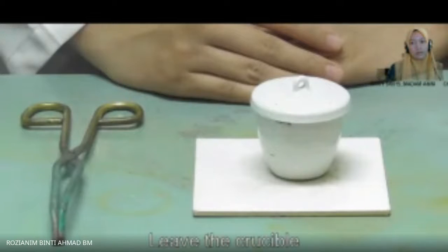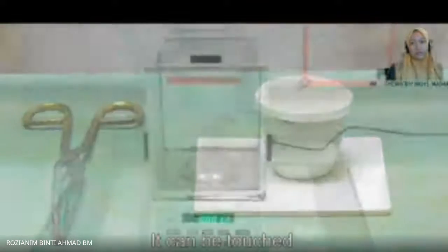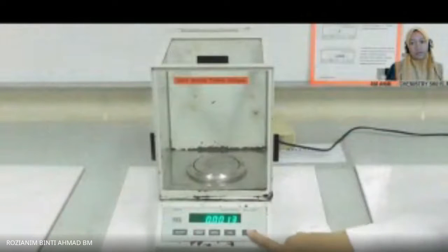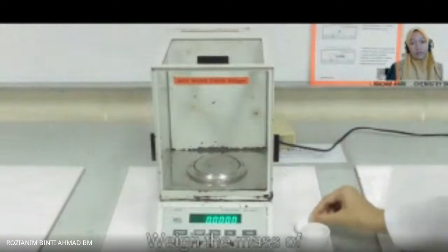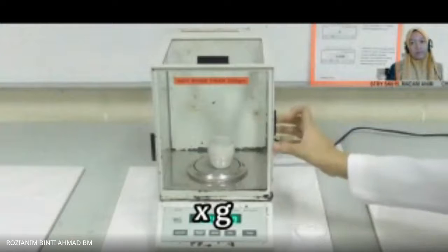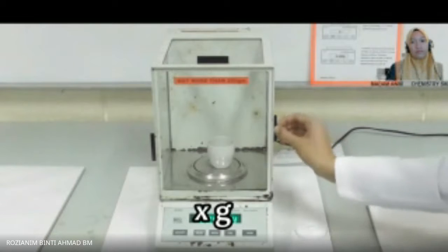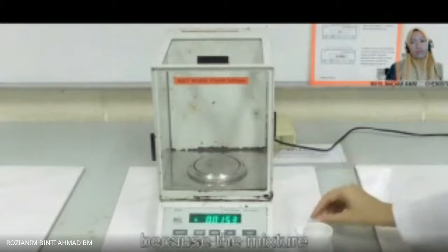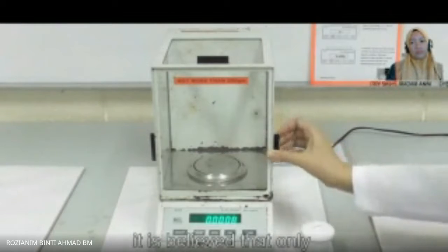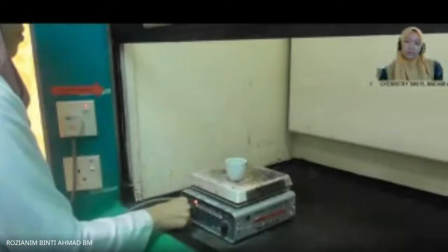Leave the crucible to cool to room temperature. The crucible is not hot anymore. It can be touched comfortably using bare hands. Weigh the mass of the crucible and dry mixture. The heating process was stopped because the mixture looks dry and therefore it is believed that only zinc chloride is left in the crucible. What if it is not true?